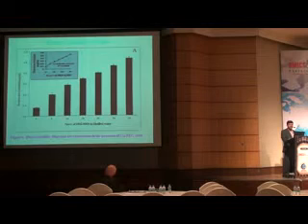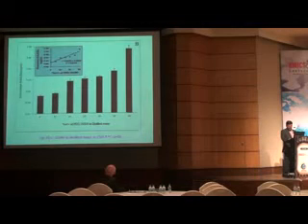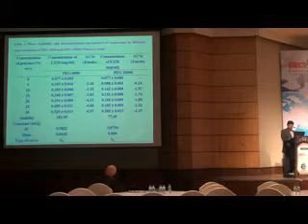So the steady state intestinal effective permeability was calculated using the equation, where Q is the flow rate of perfusate, which is generally maintained at 0.2 ml per minute in the study, and A is the surface area of the intestine segment, which is assumed to be the area of a cylinder, that is 2πRL, and based on that the area was calculated, and the radius was 0.18 centimeters, and C in and C out are the inlet and fluid transport corrected outlet solution concentrations respectively.